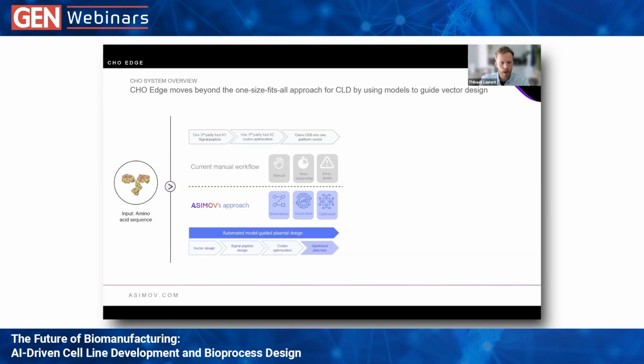At the bottom, you have the representation of the Asimov approach, where all steps are driven by models developed by Asimov with in silico design and prediction.